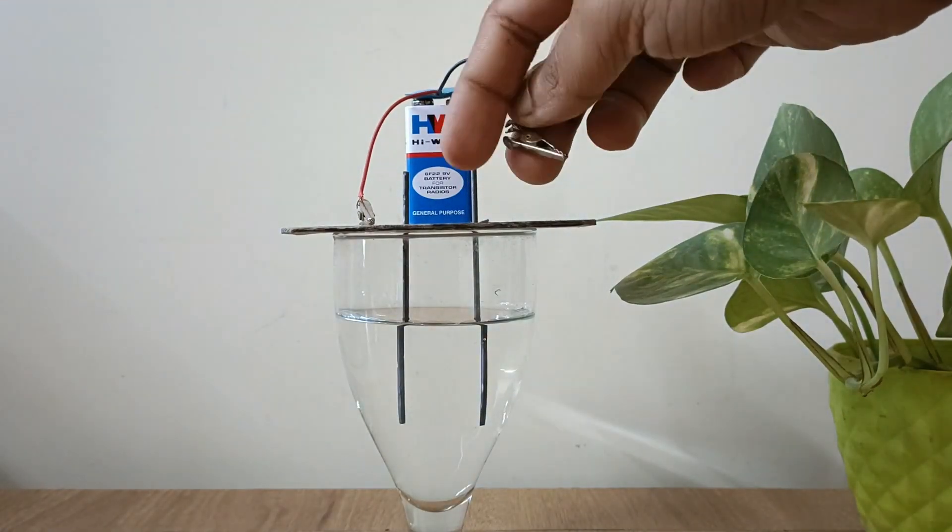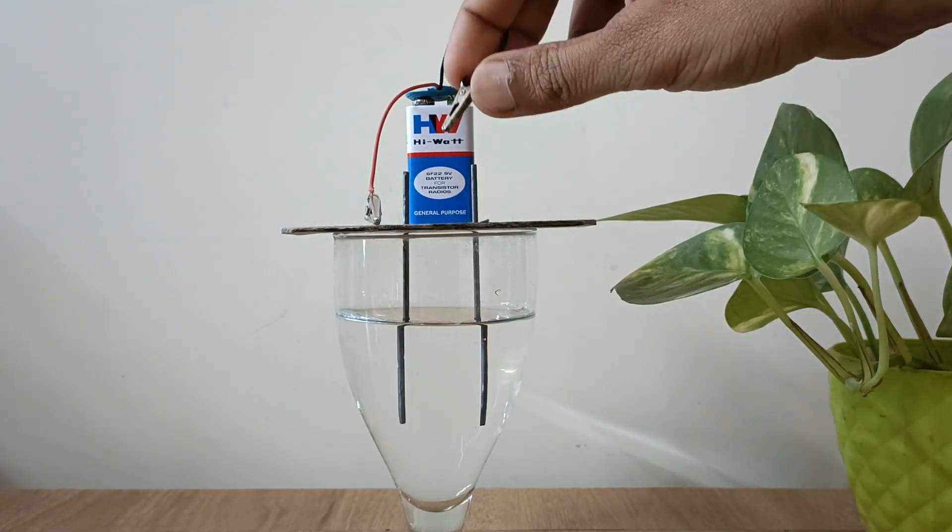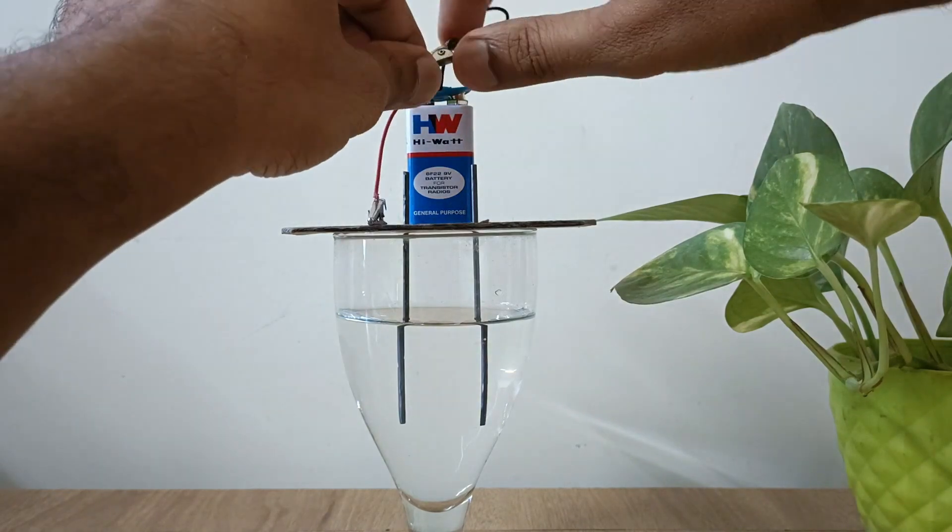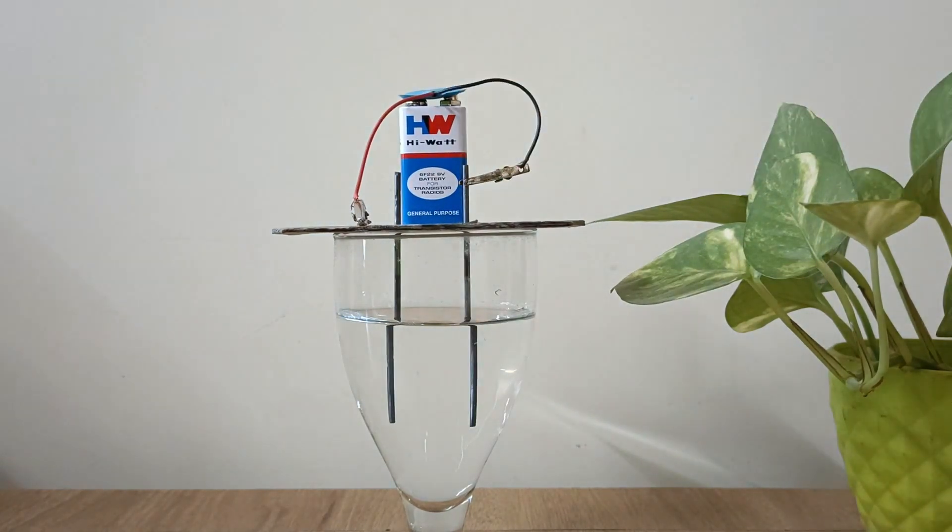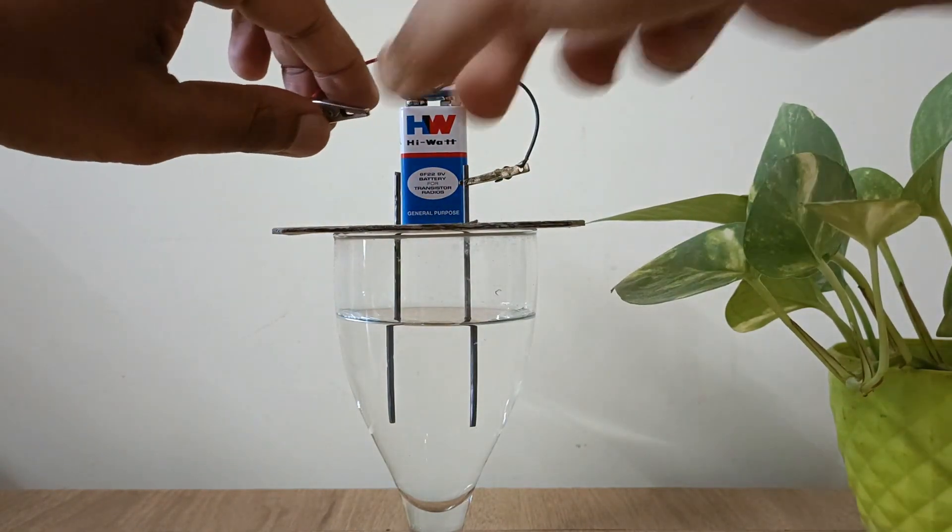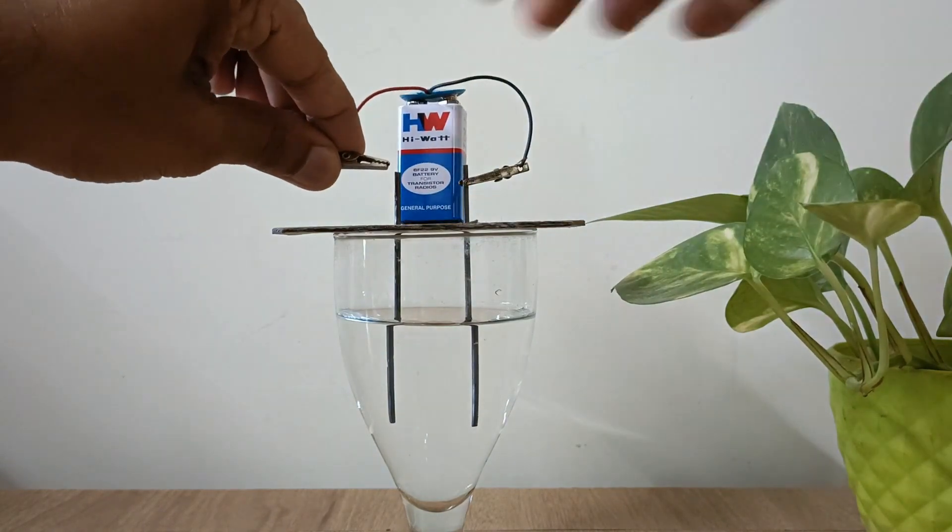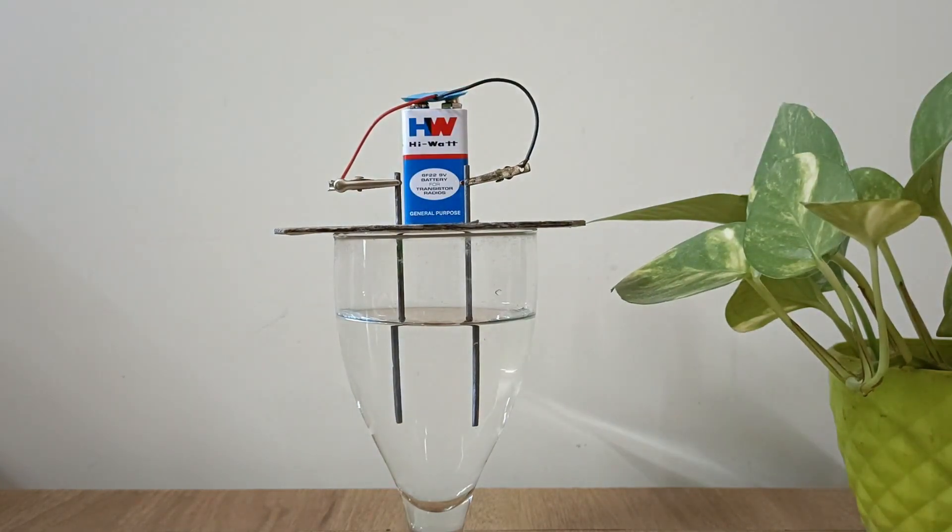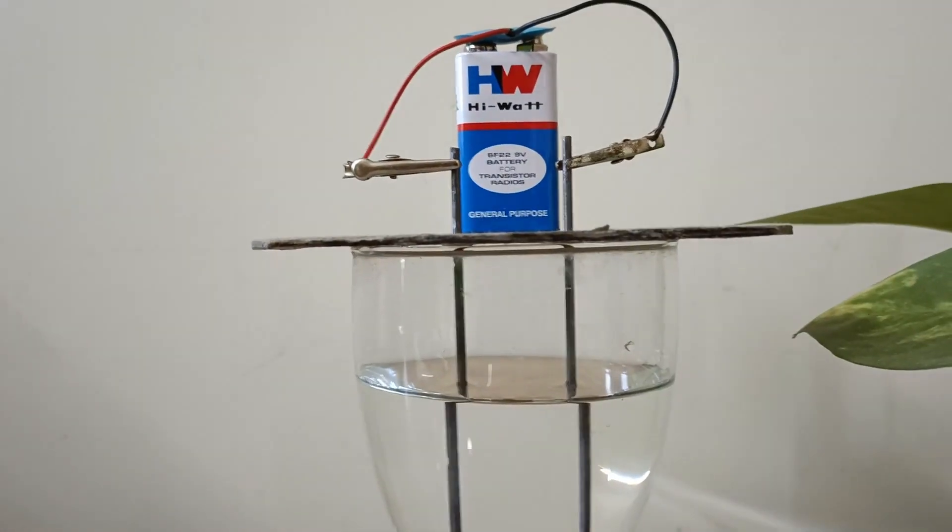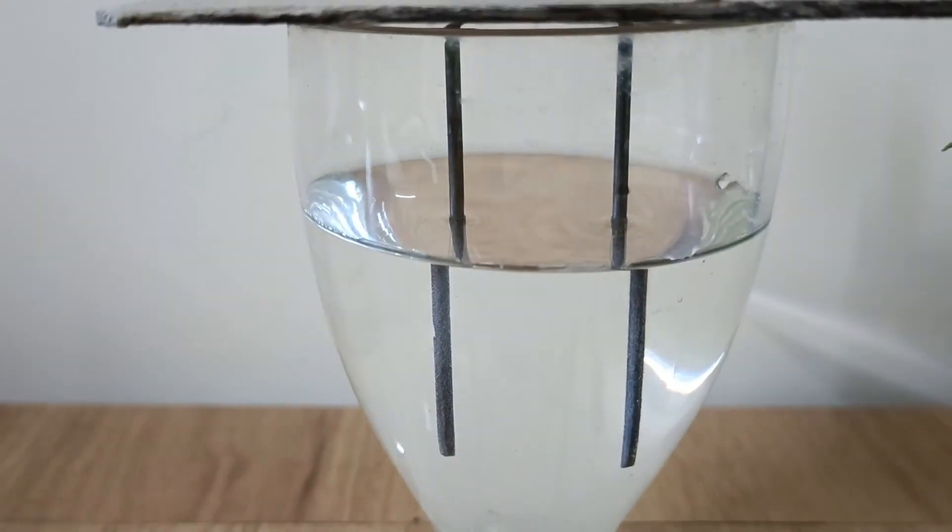Let's place the battery on the cardboard and connect both terminals of the battery to the respective electrodes. The graphite rod connected to the negative terminal is the cathode and the one connected to the positive terminal acts as the anode. You can very well see that the reaction immediately starts.